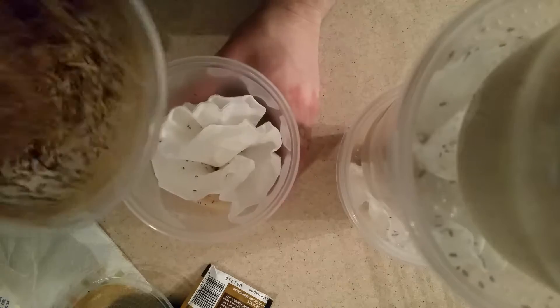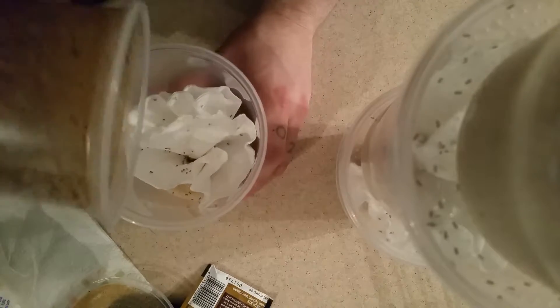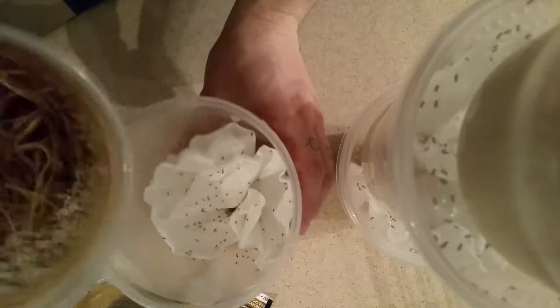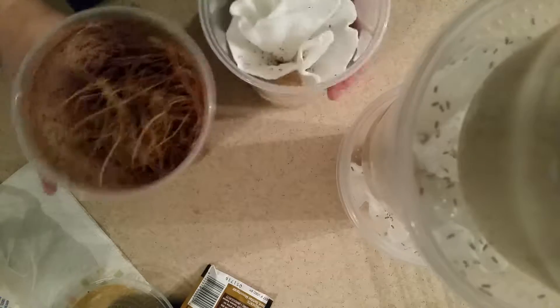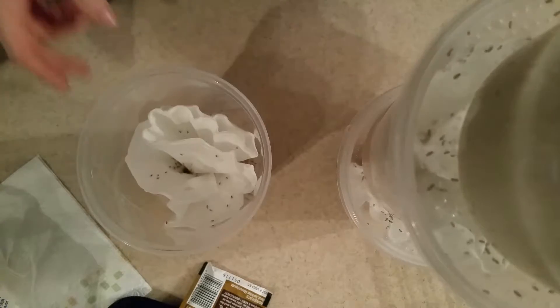You want to tap the flies in there, but as you're tapping them in, you can give the bottom culture just a tap on the bottom, then start tilting it as you're tapping the side. As you can see on the table there's no fruit flies — it takes time to get that down. Here are the four cultures I just made. There are more flies than usual — I typically only put about half that many.